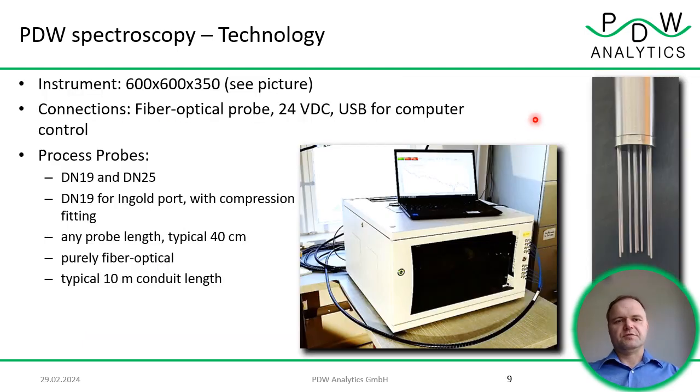Technically, the spectrometer itself is a box. Now you can see an image down here in comparison to a standard laptop. It has a few connections. Of course, the process probe, it's operated by 24-volt DC, and it has a USB port for computer control.